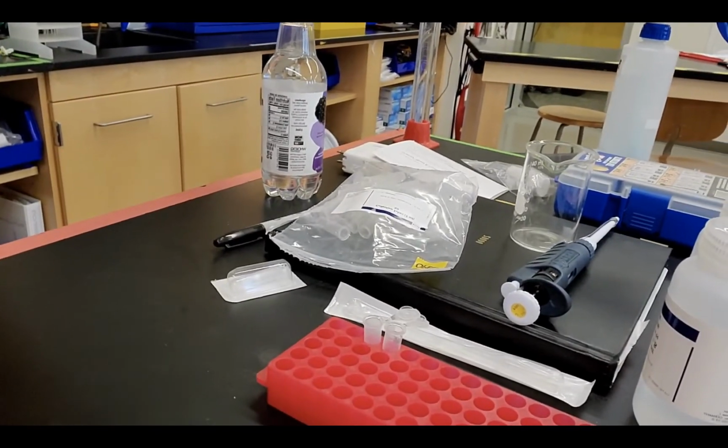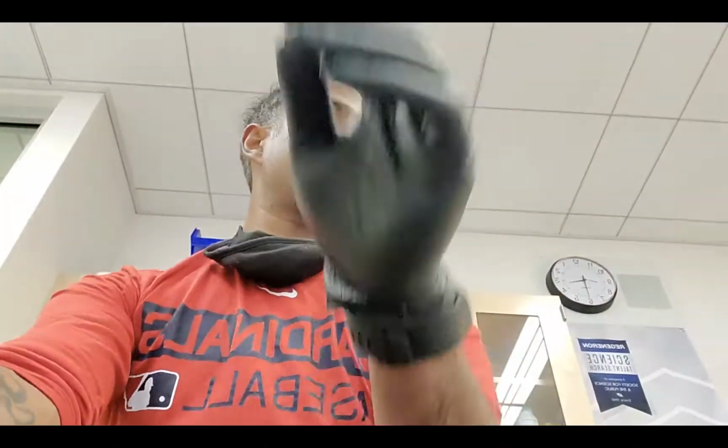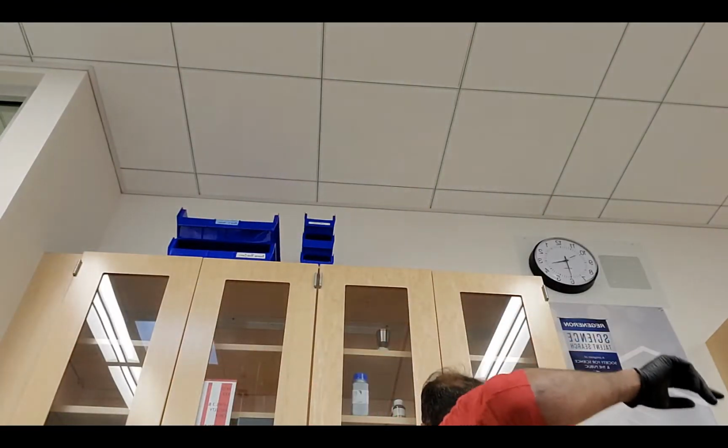Second thing I'm going to do, I'm going to make sure that my work area is clean. What I usually do is I put everything together on my lab notebook, carry it to where I'm going to work, and then I clear off an area in front of me. I'm going to go ahead and take Windex. Make sure that I have a clean working area to begin. Circular motion to get stuff off of there. Cool. All right, next thing I'm going to do is start setting up.